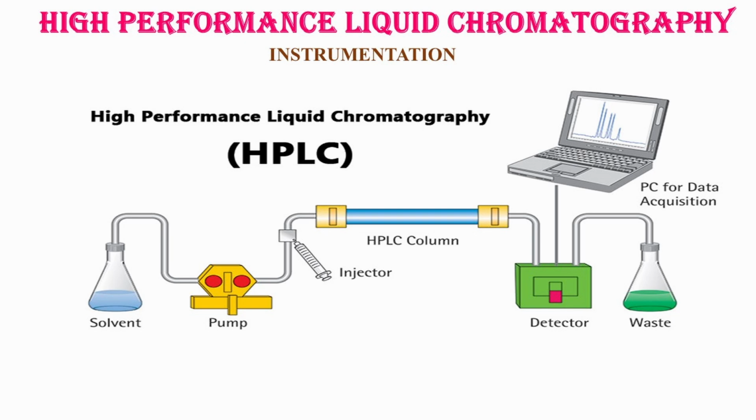The columns that are used in HPLC are made up of very homogeneous small particles which show improved physical and chemical stability, faster separation and better reproducibility compared to the traditional columns having soft gels. Very small, tightly packed particles offer a high resistance to the mobile phase flow, and the mobile phase therefore needs to be pushed through the column at a very high pressure.